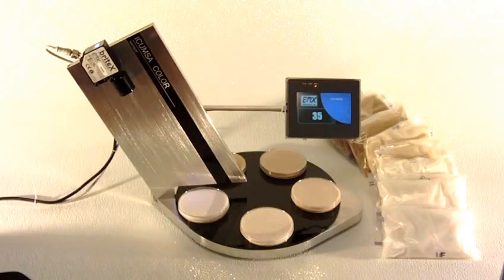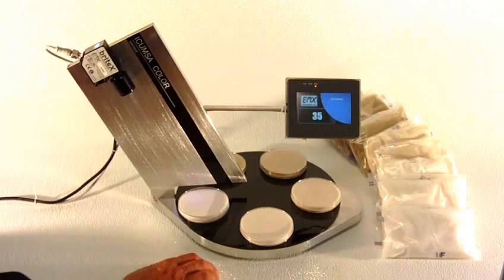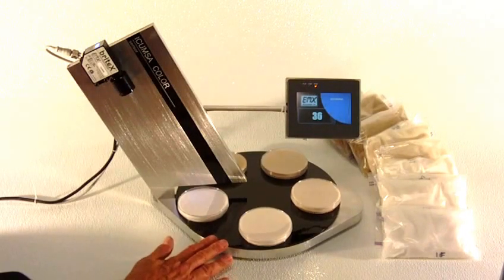We've correlated the 0 to 5 volt analog output from the sensor to ICOMSA values. Right now our standard white table sugar is measuring around 35 to 36 ICOMSA.